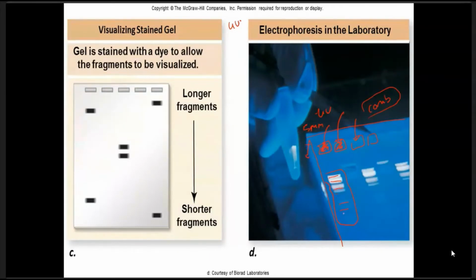You see the further away from the well, the fluorescence, the image of the band, will be lighter, maybe due to the small size. The nearer DNA sample will be brighter, maybe because of the larger mass, larger size. Here there should be a DNA ladder.